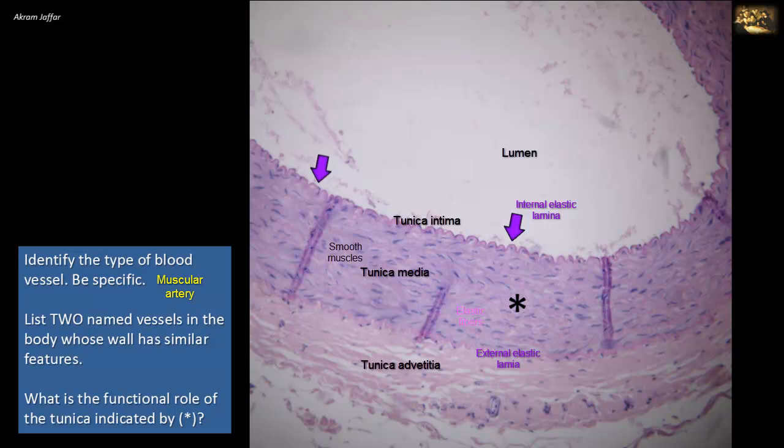For the third part of the question, the functional role of the tunica indicated by the asterisk, which is the tunica media. As we have just mentioned, there are large amounts of smooth muscles in the tunica media, and these smooth muscles help control the size of the lumen and hence regulate the distribution of blood flow to various organs. That's why these arteries, these muscular arteries, are also called distributing arteries.